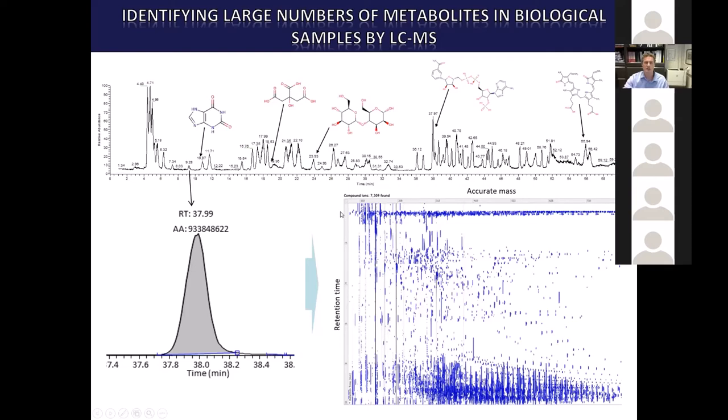It's quite interesting. If you're a mass spectrometrist or a chromatography specialist, you'd see that this is right at the beginning of a run. This is the void volume, for example. So these are m/z values you measure, but they're not chromatographically resolved using this technique. And down here is also right at the end of the run, this blue range of data points. This is what's coming out in the wash at the end when you ramp up your organic solvent concentration just to elute things that are really hydrophobic, in a reverse phase chromatography experiment anyway.